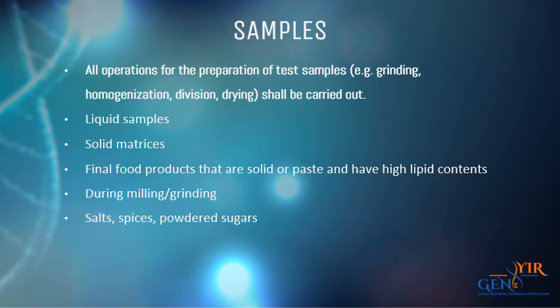Homogenize the whole laboratory sample. Sample the 2 test portions, taking into account possible dilutions or concentrations. During milling or grinding, precautions should be taken to ensure that the heating of the sample is kept to a minimum, since heating can have a negative impact on the quality of the extracted DNA. Milling or grinding techniques with a high risk of cross-contamination, such as the combined use of liquid nitrogen and mortar, shall be avoided as far as possible.